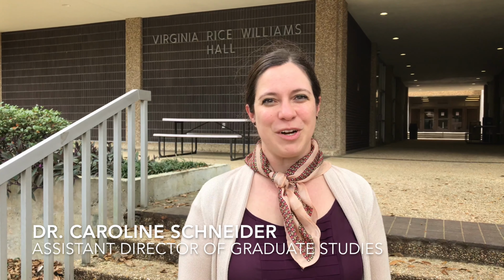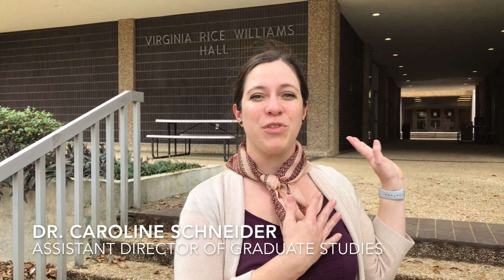Welcome to the LSU Department of Chemistry. Behind me we have 3 of the buildings that house our entire department.